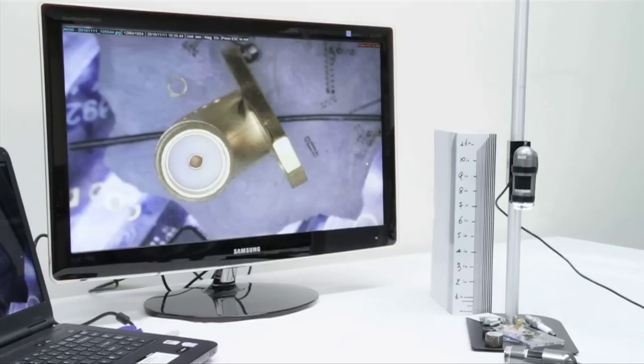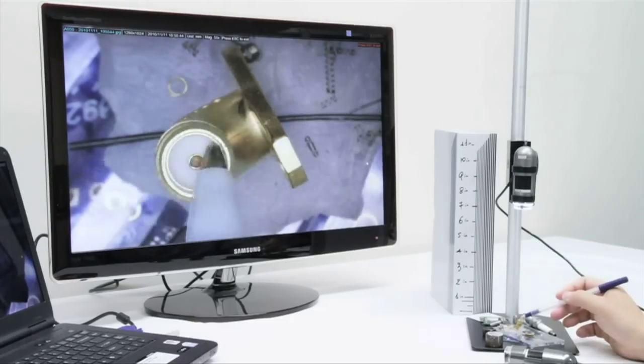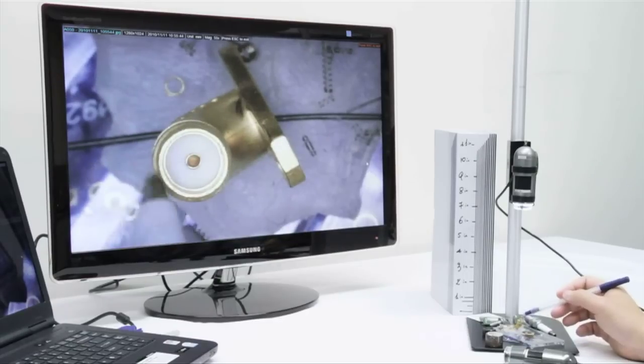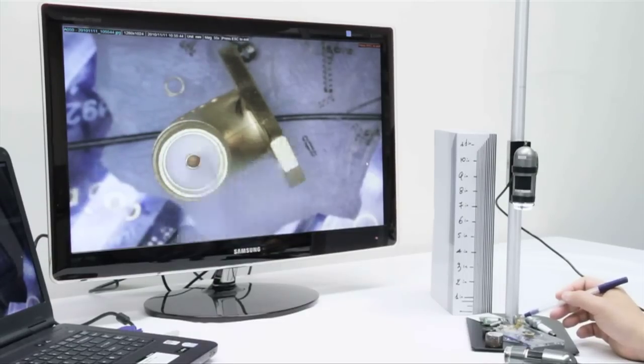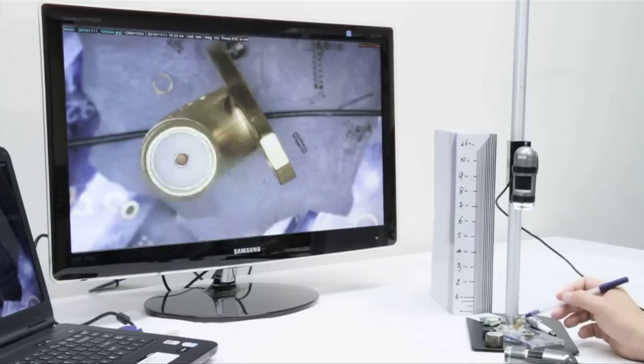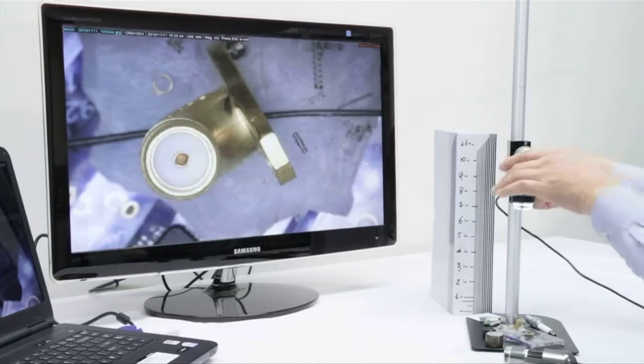This is our digital microscope so it does interact with your computer via 2.0 USB. So there is a slight delay, not too much, but it does refresh at about 30 frames per second.